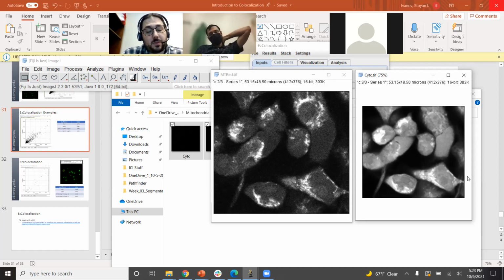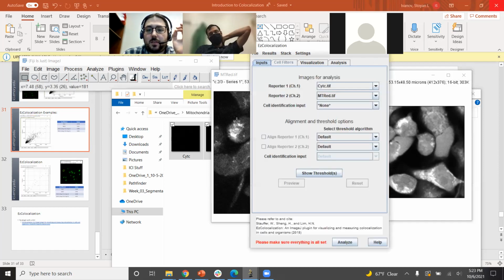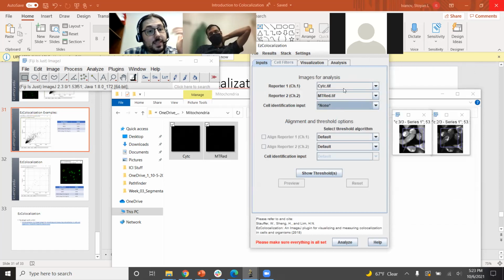You'll start to drift away from what the actual relationship is because you're looking at a lot of dead space. So the instances where you'd use the ROI checker here is in those cases where you've got data that's localized to some area, and then maybe some other signal you don't care about, or noise, or just no signal at all.